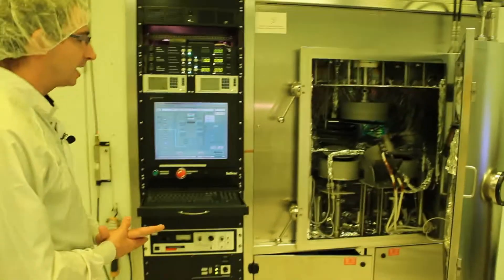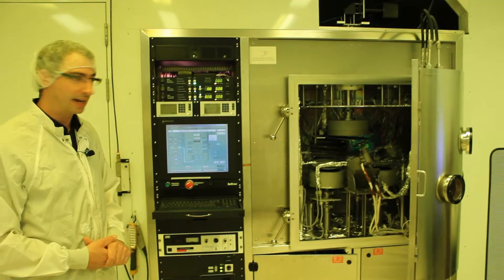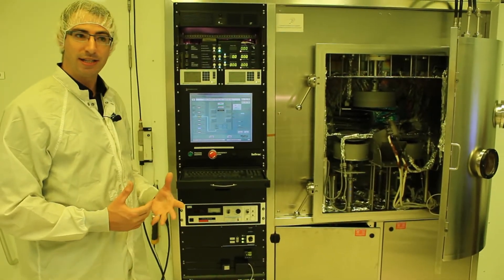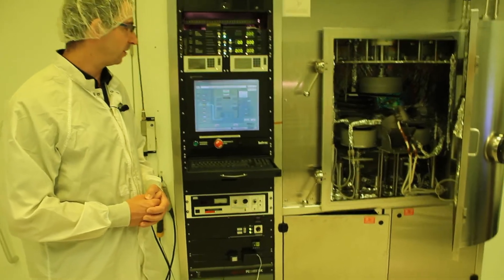This is a Canadian-made system from the company IntelVac which is based in Toronto, and it functions under the process of AC magnetron sputtering. If you want to get closer, take a look at the four targets here.